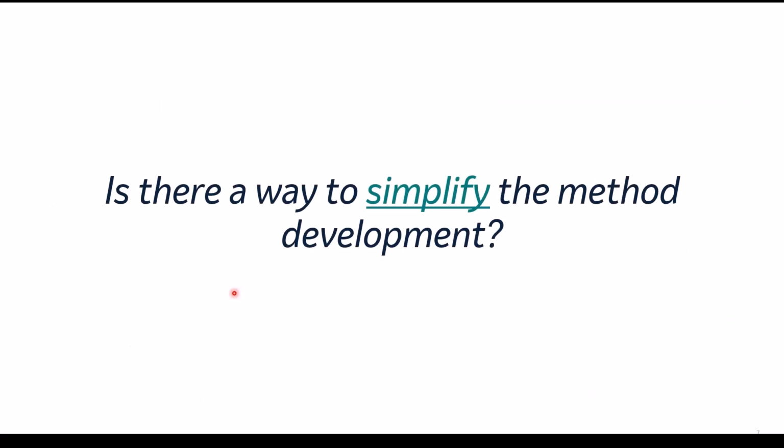However, if we now have to consider multiple techniques, if we have to consider different chromatographic modalities, we can imagine how the method development becomes incredibly more complex, more challenging. Is there a way, therefore, to simplify the method development?